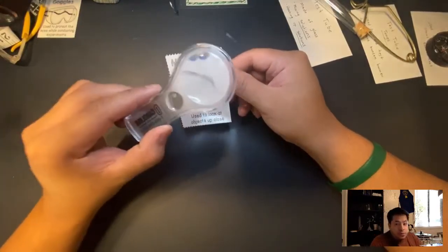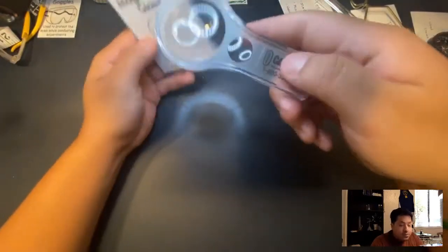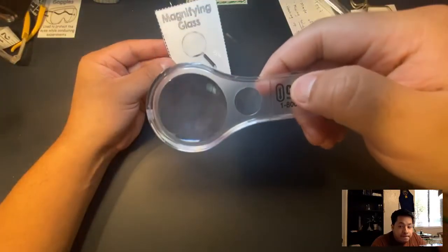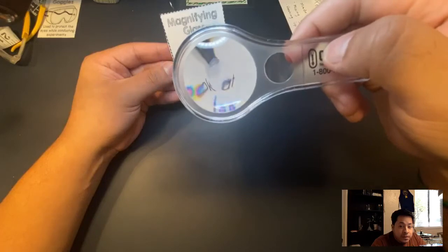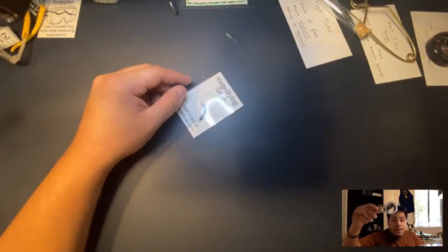Next is a magnifying glass, which is used to look at objects up close. Let's see if this works — yeah, that works. A magnifying glass is used to see an object up close.